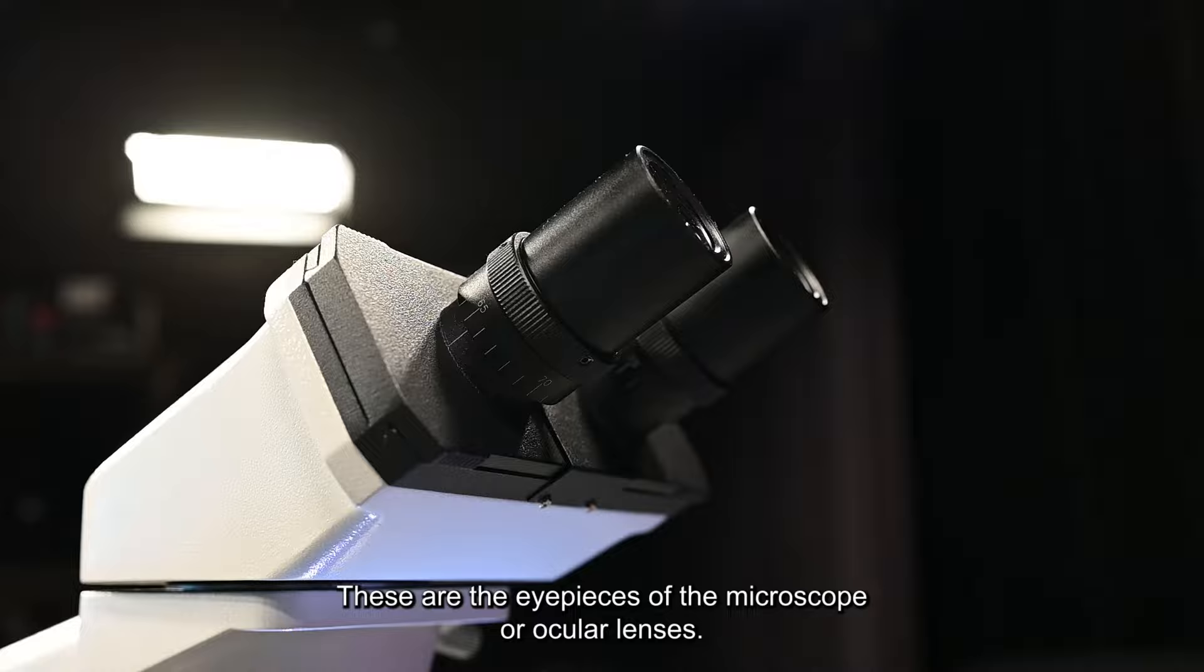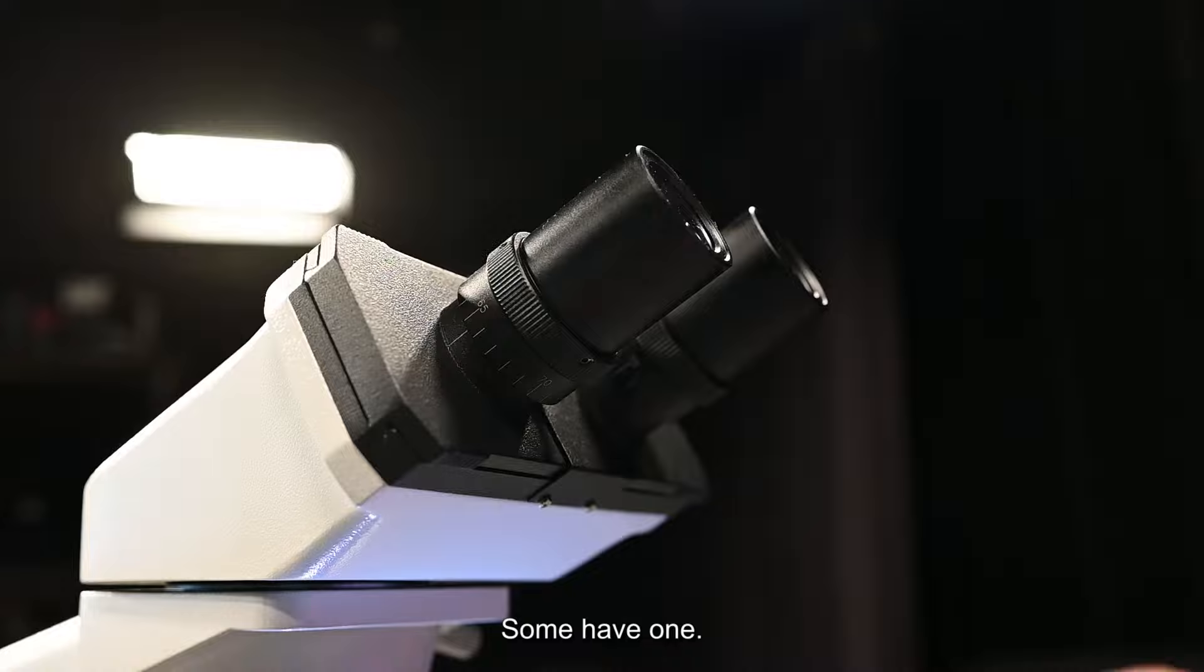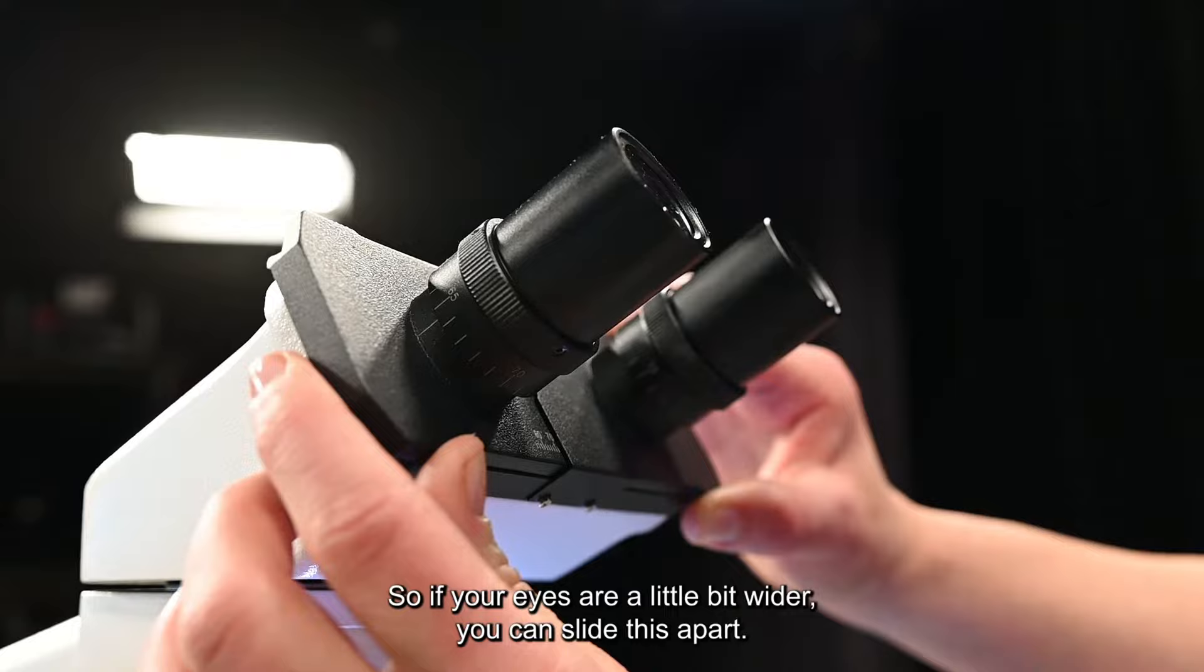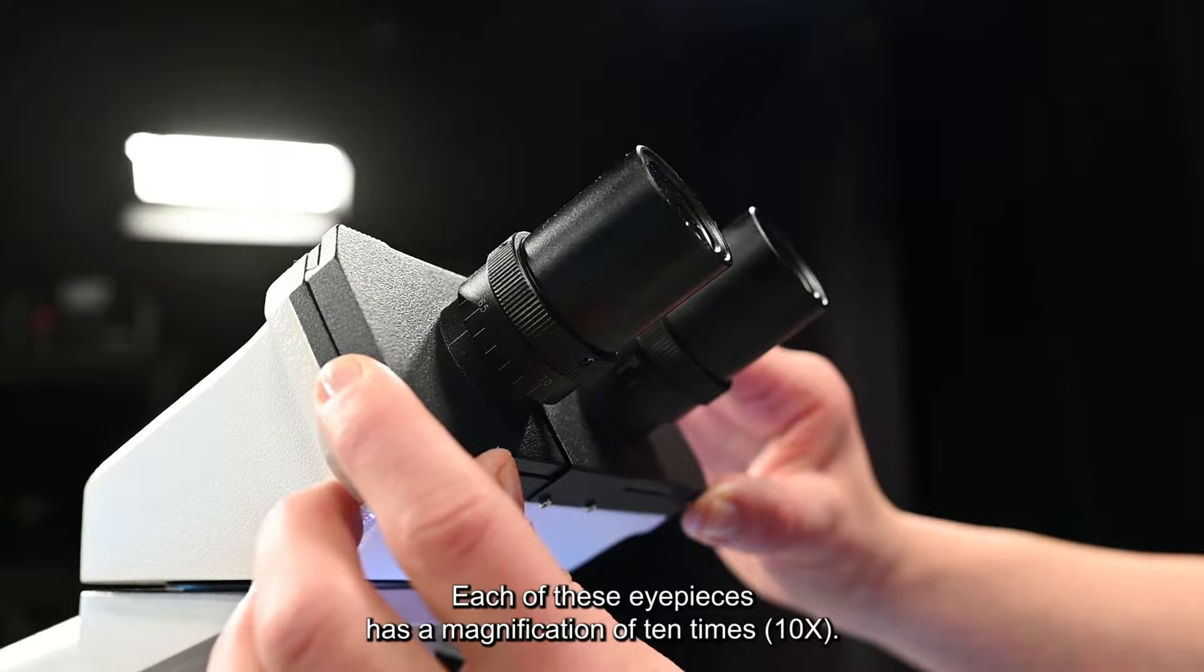These are the eyepieces of the microscope or ocular lenses. This microscope has two. Some have one. It's designed for you to look with two eyes. If your eyes are a little bit wider you can slide this apart. If they're a little bit closer together you can slide it inward.